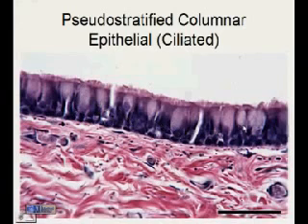But again, the key items here, I would tell you where it's located. I would tell you this particular cell is located in the male reproductive system. It has surface appendages. Please identify this cell type. You would be able to tell me pseudostratified columnar epithelium. I would then ask you to identify this surface appendage, and you would tell me cilia.